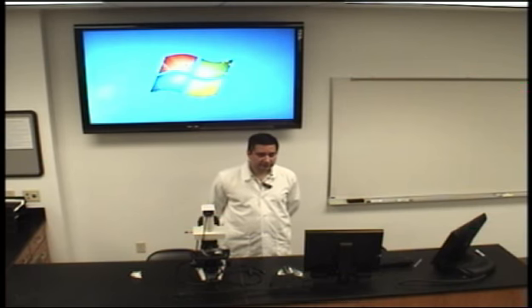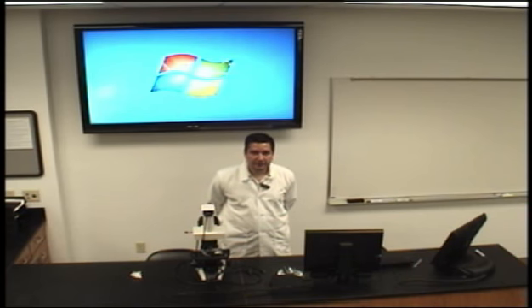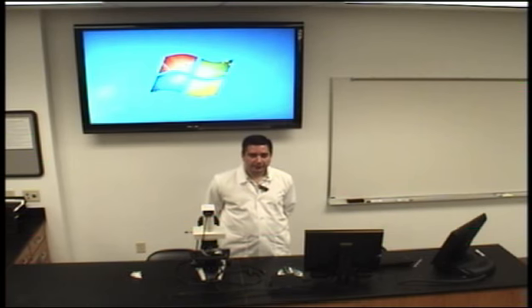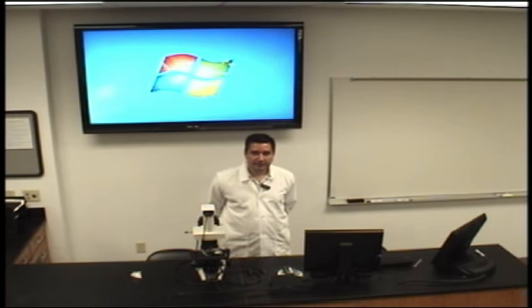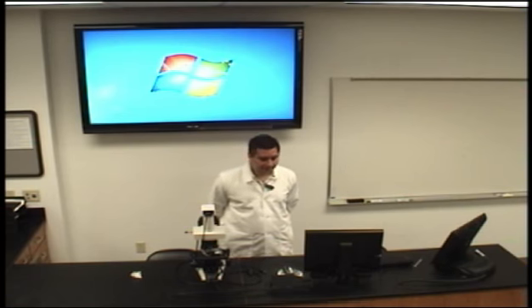I'm the Assistant Director of the Microbiology and Immunology Undergraduate Department here at the University of Miami. Today I'd like to go through with you the teaching assistant setup we have in the front of our Introductory Microbiology and Immunology laboratory. The laboratory runs concurrently with the Introductory Microbiology and Immunology course, which is offered in the spring semester of every year.